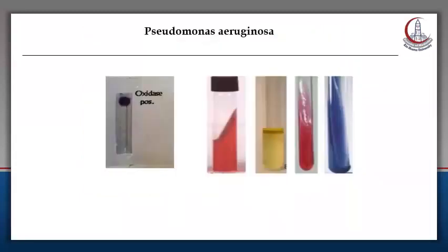In the second scenario, Pseudomonas aeruginosa gave on the plates exopigment on nutrient agar, beta hemolysis on blood agar, and non-lactose fermenting colonies on MacConkey agar. And when we performed the direct Gram stain film, it gave, yes, Gram-negative bacilli with no special arrangement. So we have identified the colony, and now we go to further identification by biochemical reactions.